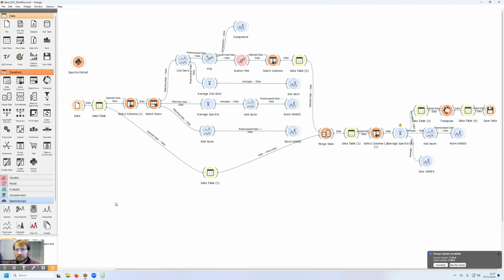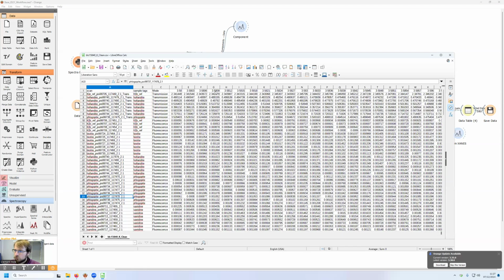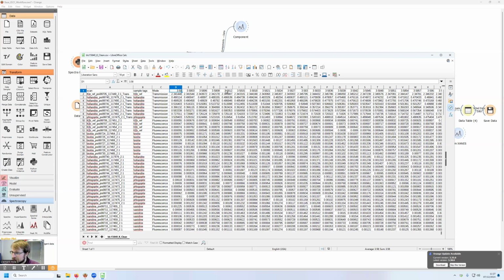data to be shaped in a very special way. This way is the following. So here you can see an Excel spreadsheet, and you basically want each scan to have an individual name, with each scan, each spectrum, being a row. So here you can see on the first row we have the energy scale, and then we have a first spectrum, a second one, a third one, etc.